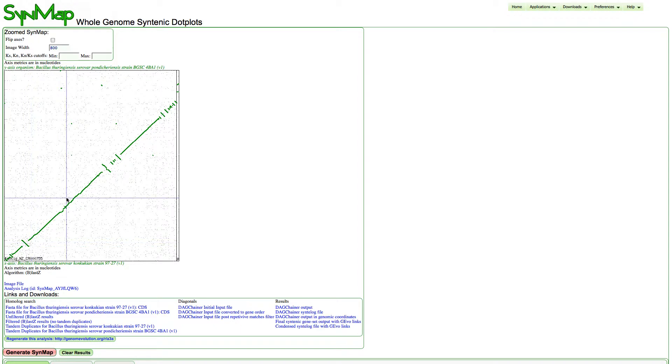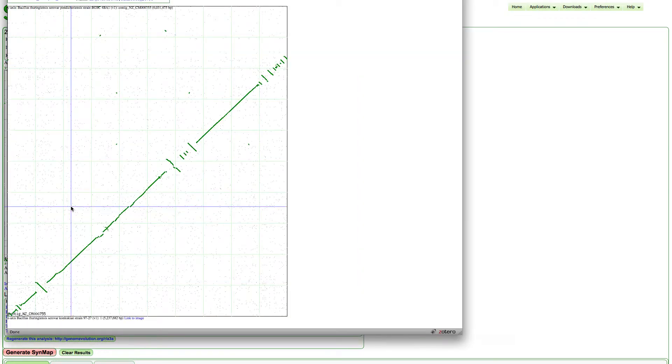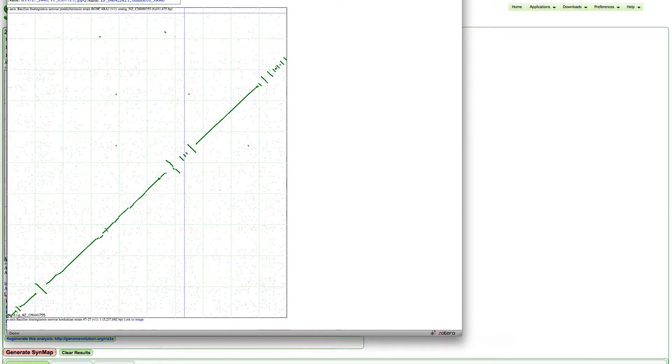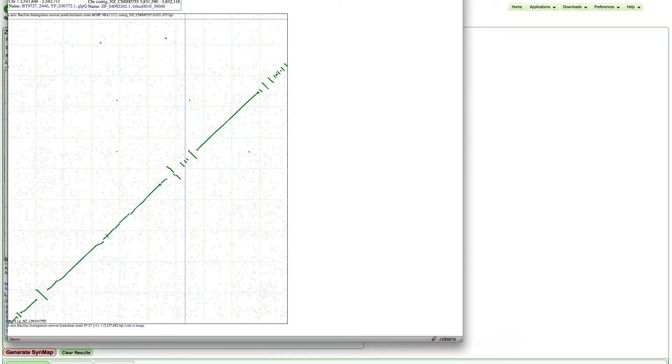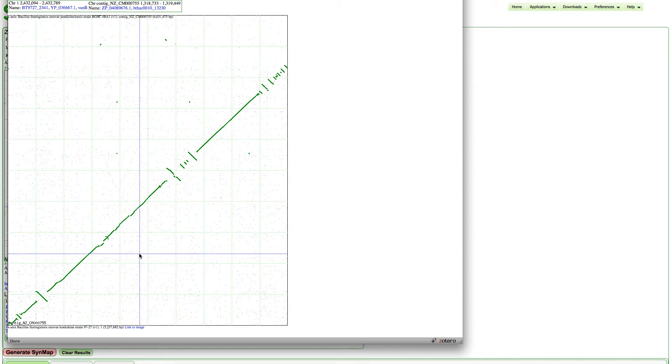To do that, using this master dot plot image, I'm going to click on the central chromosome comparison, and this will pop up a zoomed-in version of that dot plot.